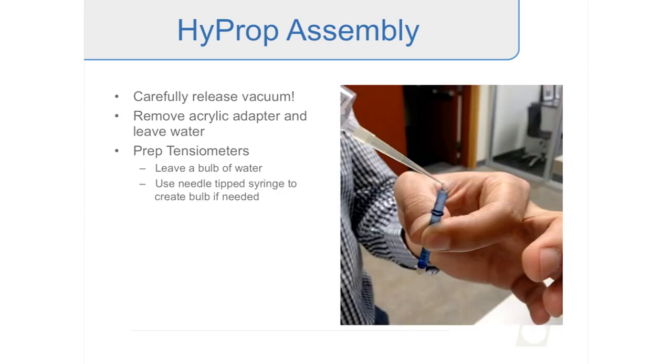When disconnecting the tensiometers from the syringe or threaded adapter, make sure you leave a nice bulb of water at the end — this prevents an air bubble from getting inside when you connect to the sensor unit. If you lose that bulb, you can use the needle tip syringe that comes with the HyProp refilling kit to re-add degassed water. Make sure there's no air in the syringe or needle tip when doing this.